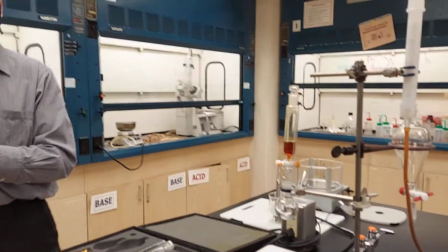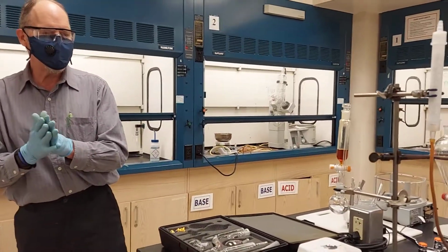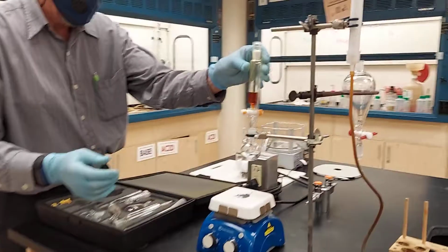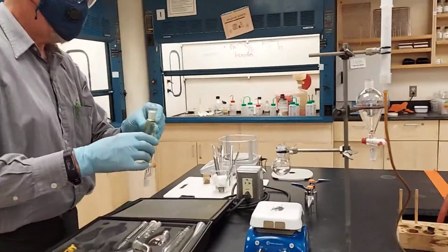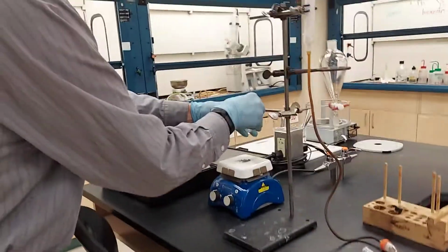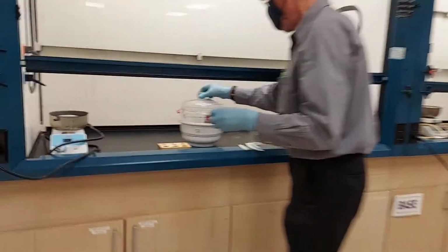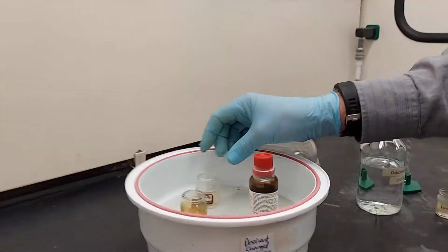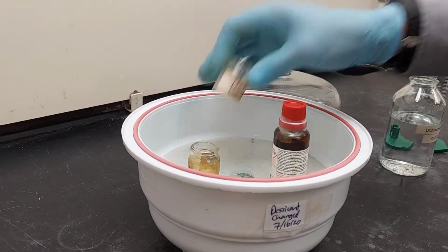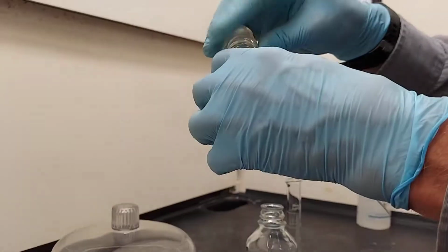Right there. Now we need to make our catalyst solution as well. And how much aluminum chloride are we going to put in there? 1.35 grams. I'm going to rest this over here for now. 1.35 grams aluminum chloride. Aluminum chloride's our catalyst today. Here's the reagent. And how much did you say? 1.35.